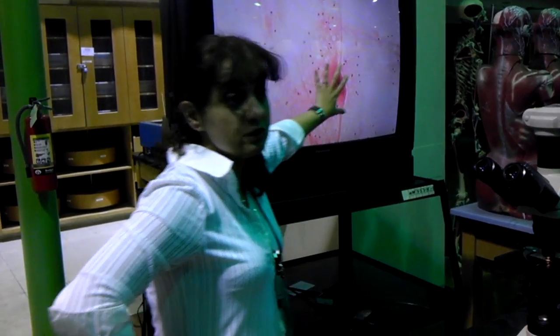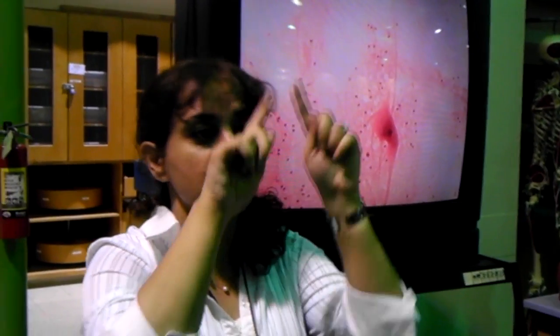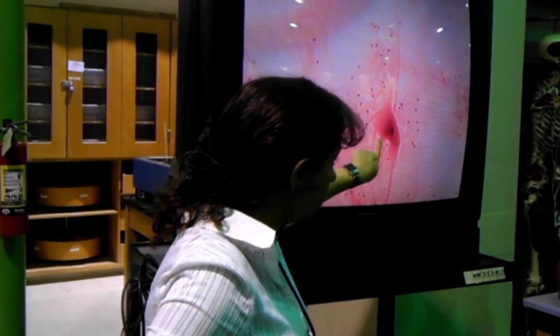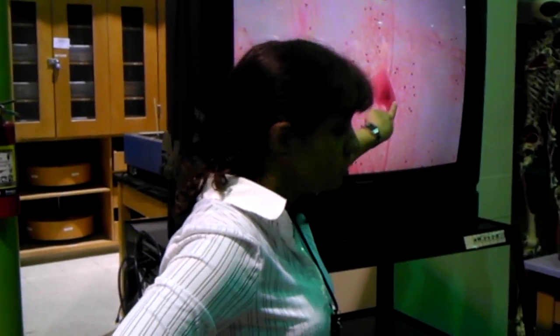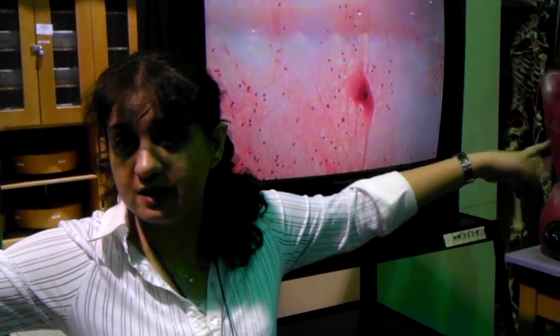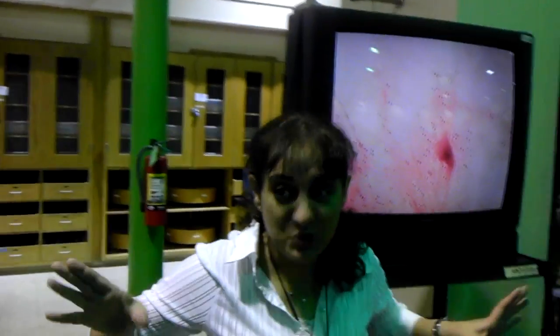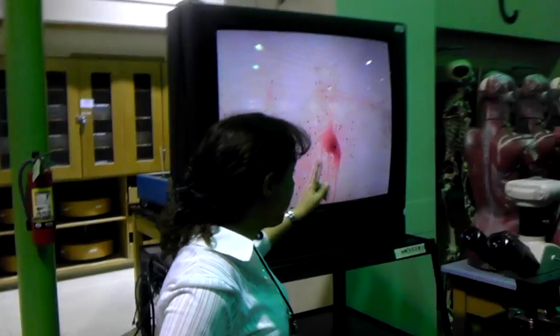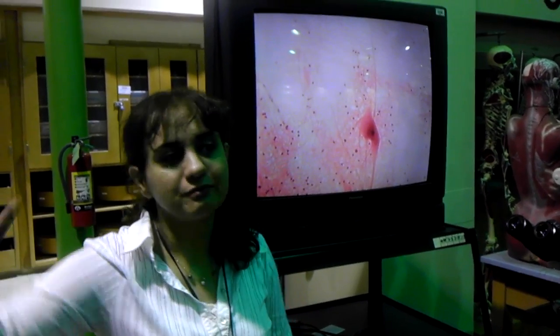So the structures that you need to distinguish here: each neuron consists of the central part, called the cell body. Inside the cell body you have the nucleus and cytoplasm, and you have the short branching processes which come out from the cell body. These are dendrites. The dendrites are multiple short branching processes, right? And we also have a long single one which is called the axon.